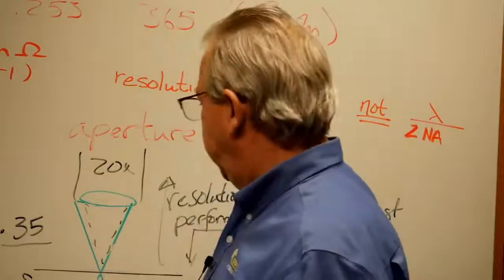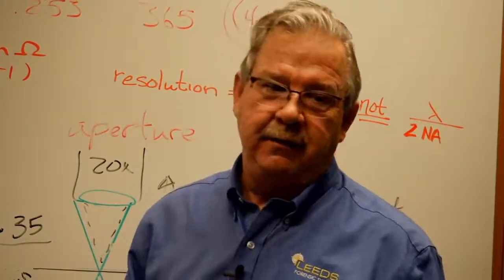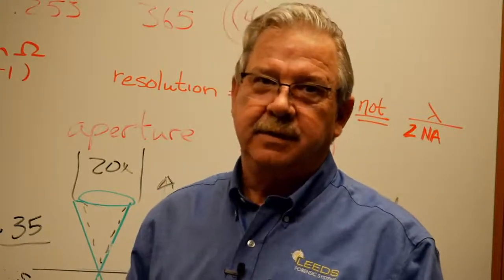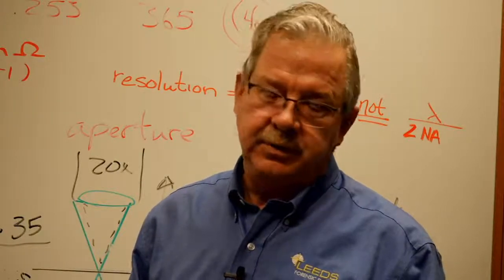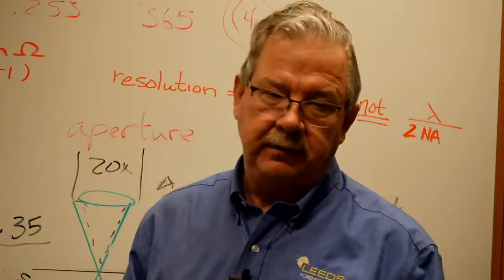Again, if we were to look at a compound microscope, I can open and close my aperture diaphragm probably all the way and not really see a loss of resolution. Well, that's a relatively low numerical aperture objective, and we're not trying to extract a lot of resolution out of it.